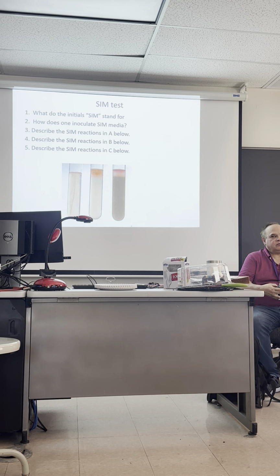What's being broken down? Tryptophan. Tryptophan, very good. What if I asked, what is the presence absence indicator for hydrogen sulfide?